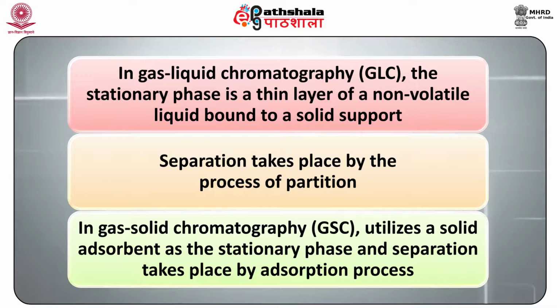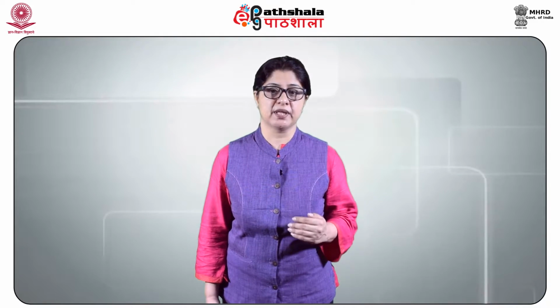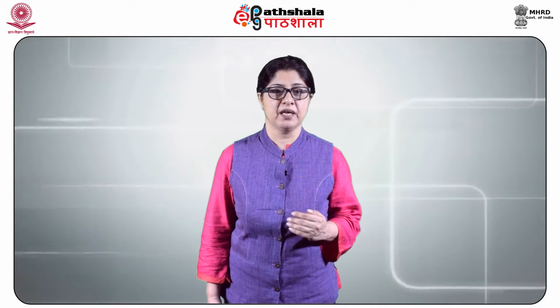On the other hand, gas solid chromatography, GSC, utilizes a solid adsorbent as a stationary phase and separation takes place by adsorption process. Gas liquid chromatography is more popular than gas solid chromatography and has relatively more applications.